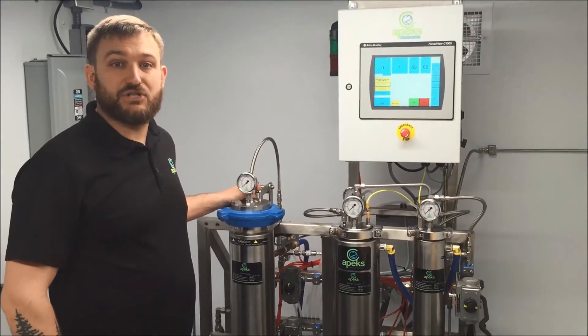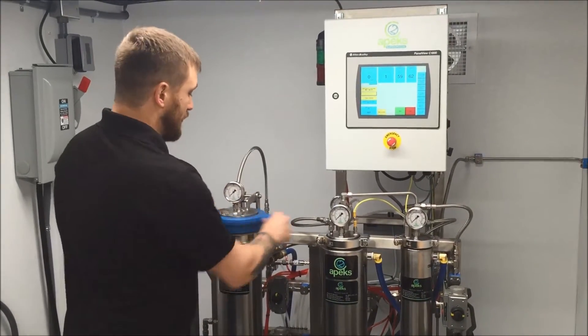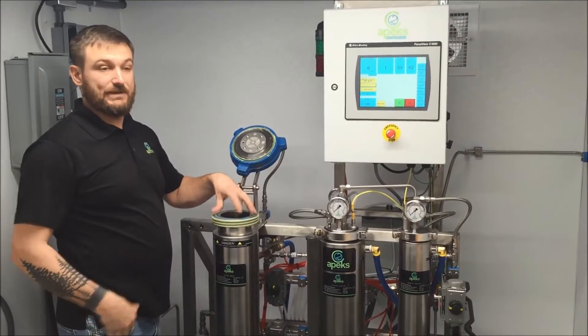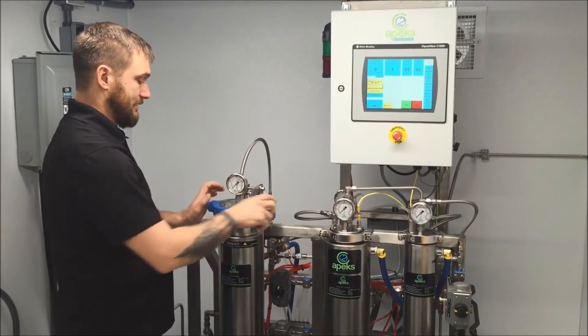Let's go through a startup on the machine — I'll show you how it works. First of all, you'll come over here and load your three to four pounds of plant material inside. You just hand tighten and hand loosen. We send a funnel — you load your ground up dried plant material in here and close it.